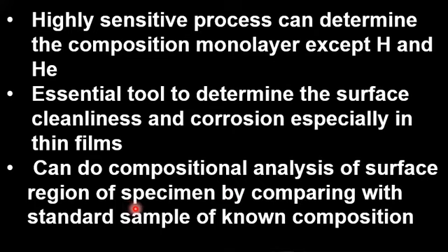The reason, dear student, is that the depth of Auger electron spectroscopy is in the range of 3 to 10 nanometers, so you can achieve compositional analysis in that range.